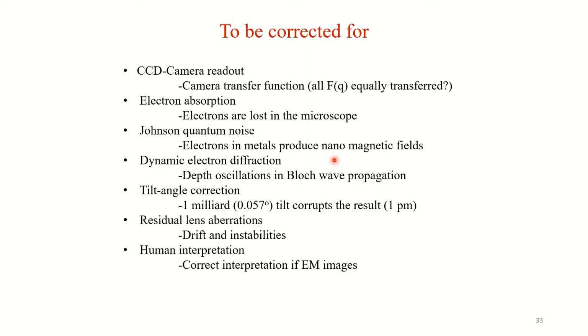For example, you have a 10 centimeter metal tube, and the velocity of the electron is 230,000 kilometers per second, so it takes 500 picoseconds to pass through that 10 centimeter long tube. While doing so, the electrons from the beam just see snapshots of those magnetic fields. You don't have a sufficiently long tube to average this deflection or distortion in the beam path. So this quantum noise is very difficult to correct for.